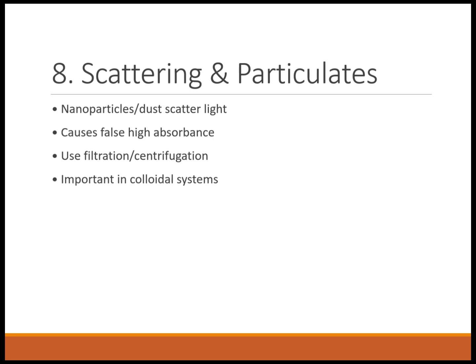Scattering increases absorbance artificially and distorts the baseline. So the sample should be particle free and dust free. Sample filtration or centrifugation is necessary, especially in case of nanomaterial studies.